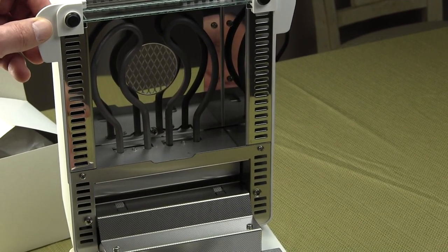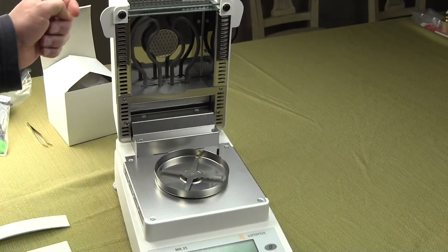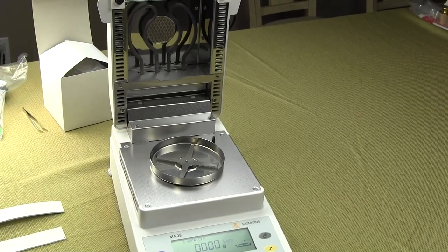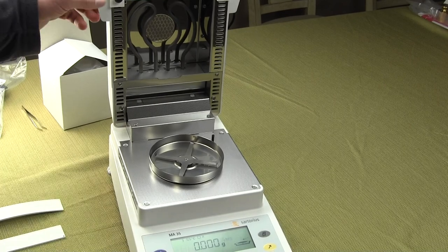So this is the MA35. The heating element is the metal tubular type. It does take a little bit longer to heat up, and we're going to go over some of the features and how to use this moisture balance.